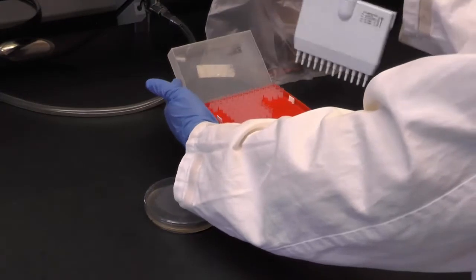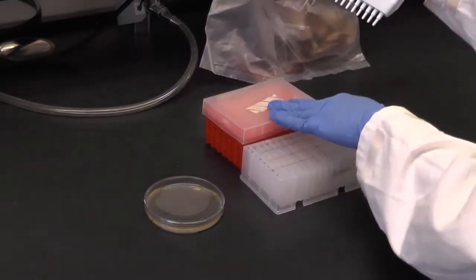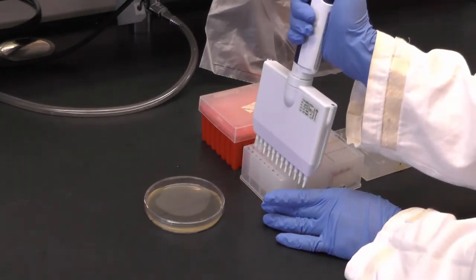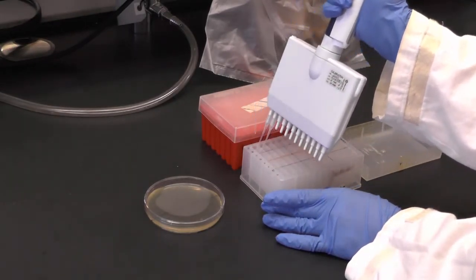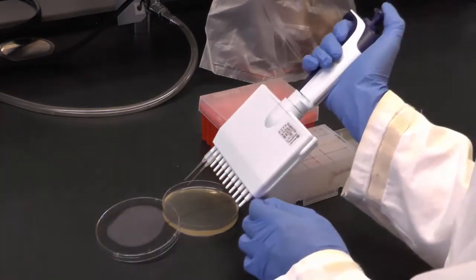Attach the number of tips onto your pipette that matches the number of dilutions you want to plate and insert the tips into the wells that hold the dilutions needed. Draw up 10 microliters of liquid and double check if the volume in each pipette tip is the same.